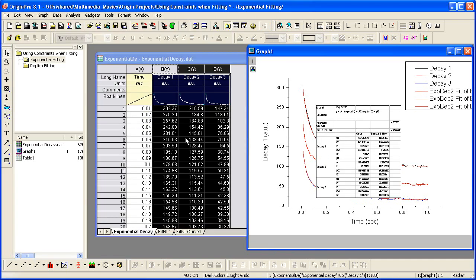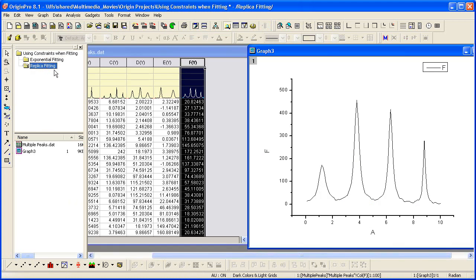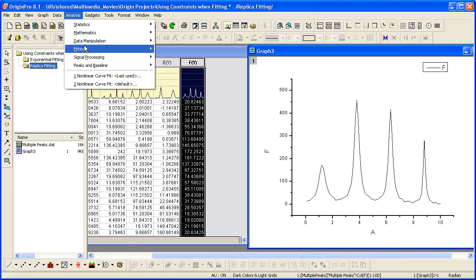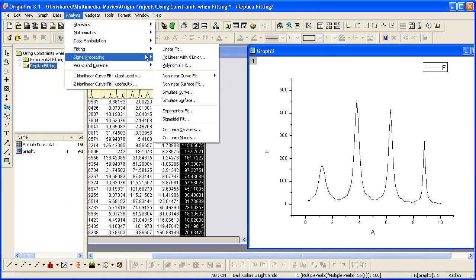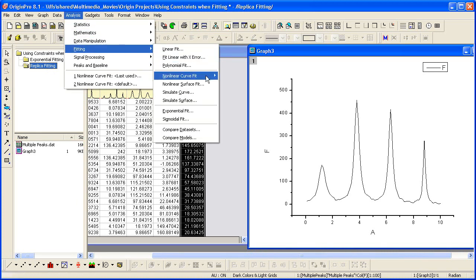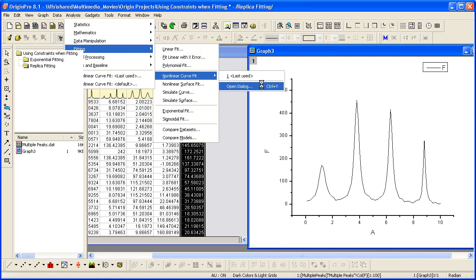Now let's switch to another graph and do some replica peak fitting. This graph has four peaks. To fit these, I'm going to select analysis, fitting, and again nonlinear curve fit and open the dialog.